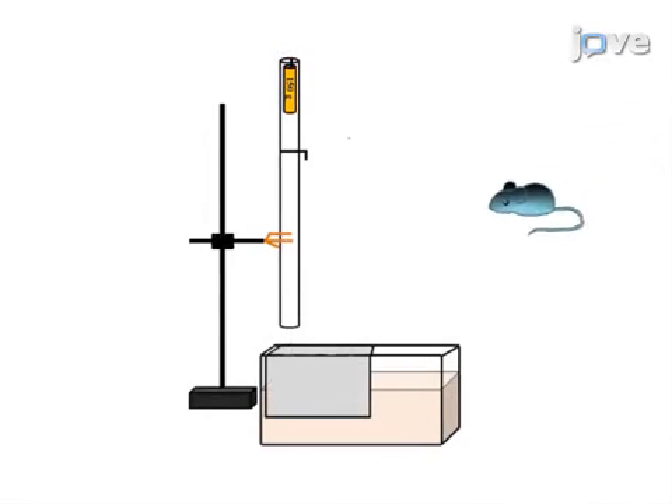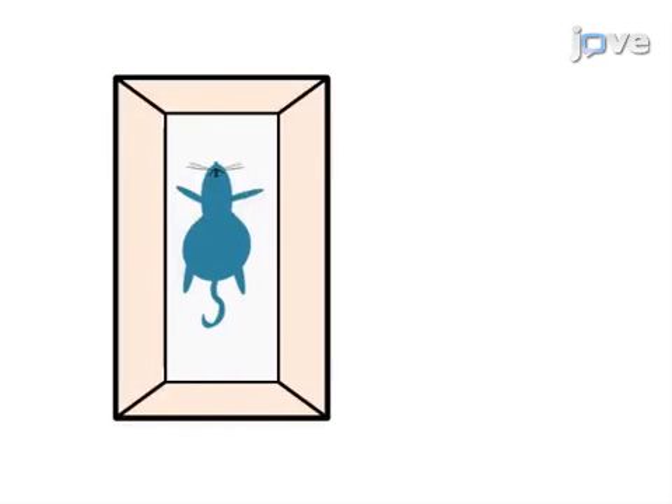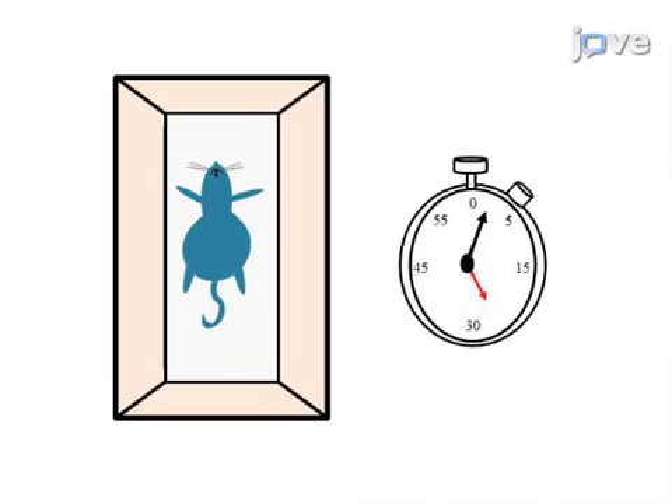Next, an anesthetized rat is placed face down on the scored tin foil. Once in place, a weight is dropped to generate a glancing blow to the head. The animal is then placed in a supine position, and the time it takes to right itself is recorded.